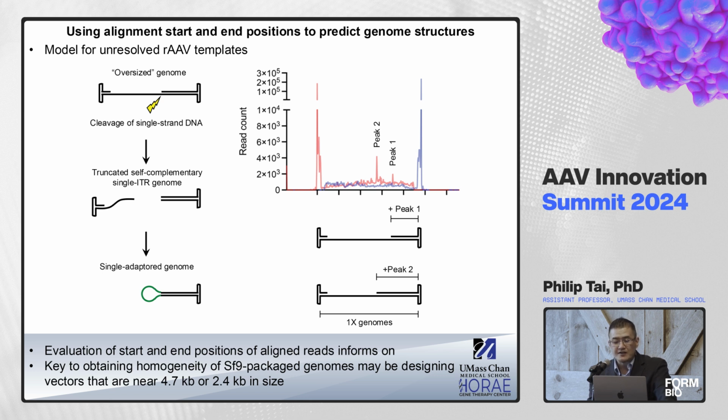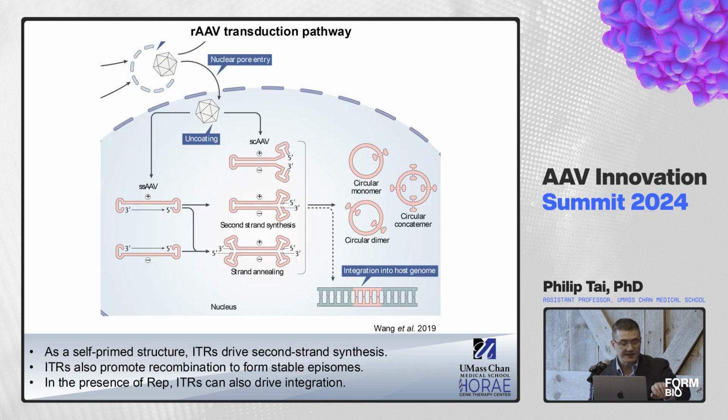And so you can then reconstruct the composition of these genomes as such. Okay, and then when you compare back to the alkaline gels that you run, these are the exact species that we find. So when looking at your data, I would argue that these types of species may not necessarily exist within the original prep, but may come from artifacts that are related to the library prep steps.